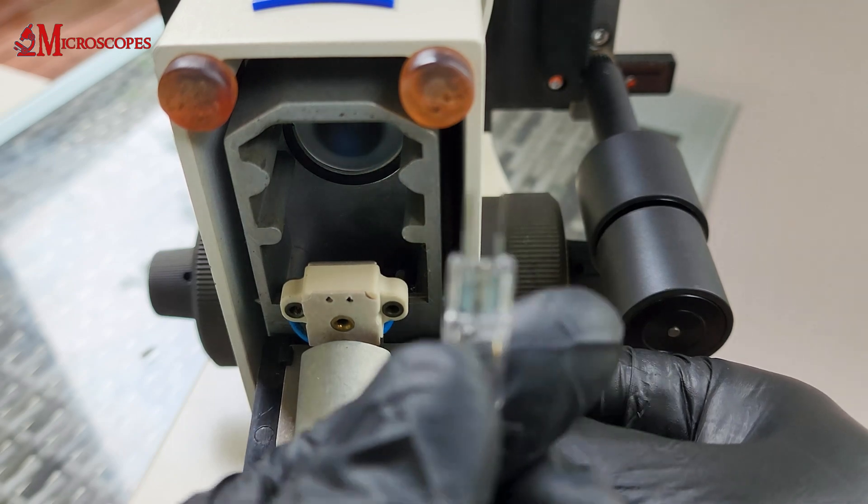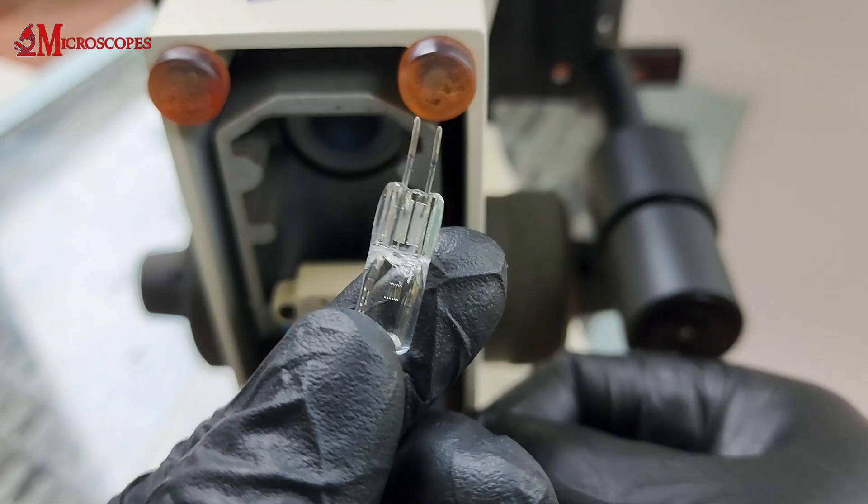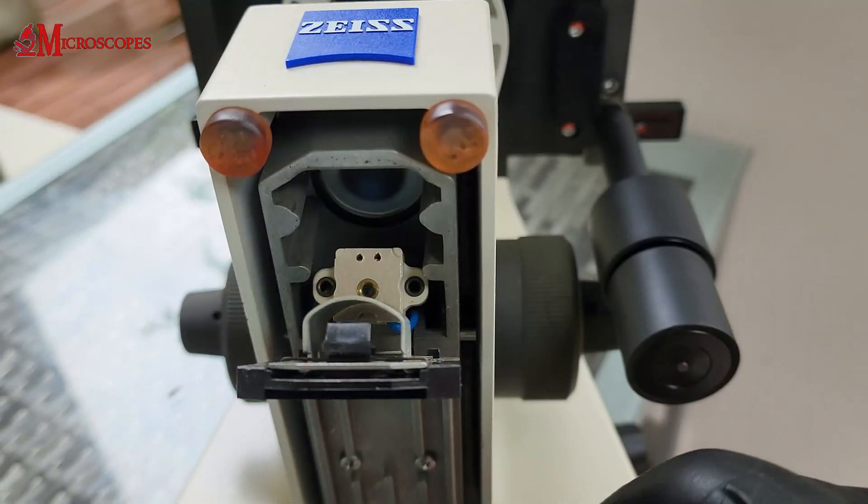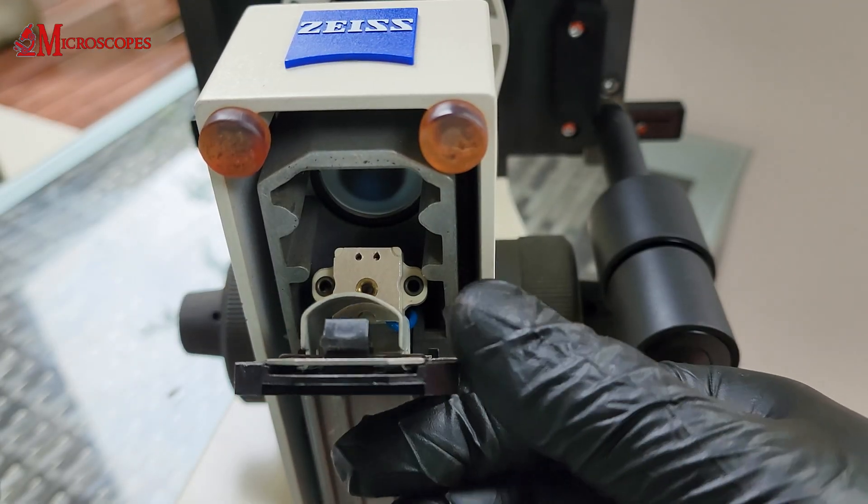Identify the location of the halogen bulb on your microscope. It is usually positioned near the base of the microscope. There may be a cover or access panel that needs to be removed to access the bulb.